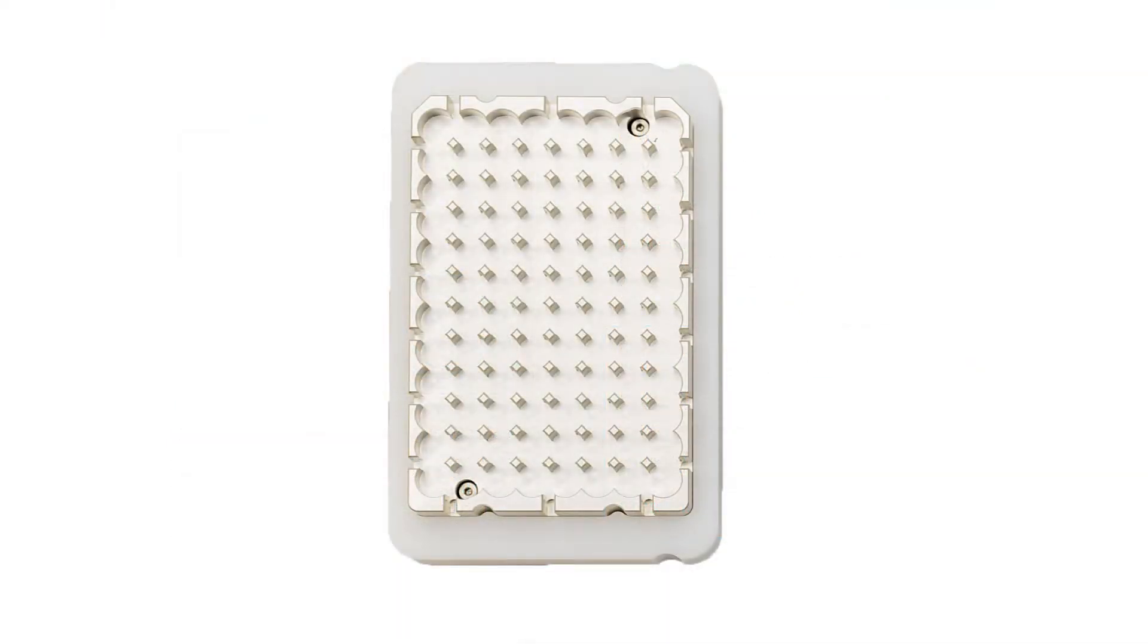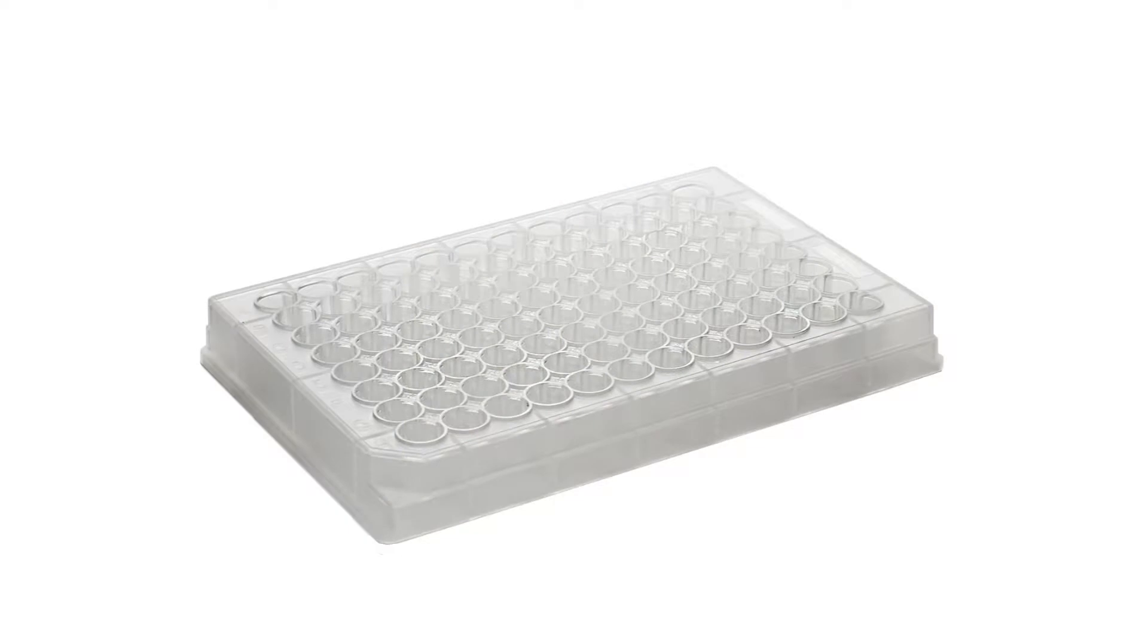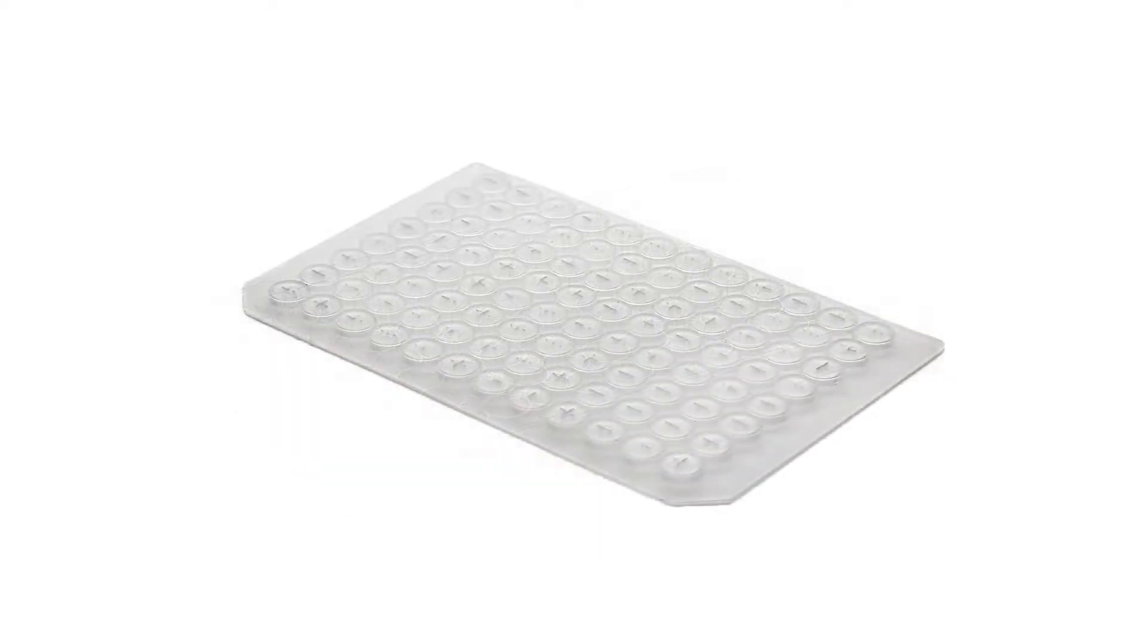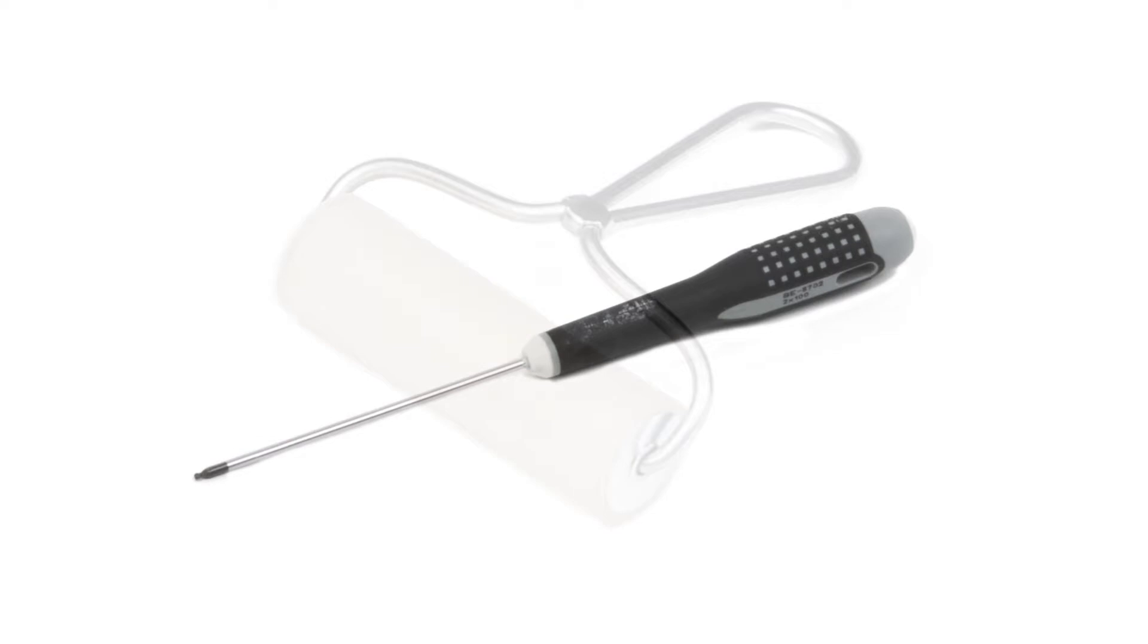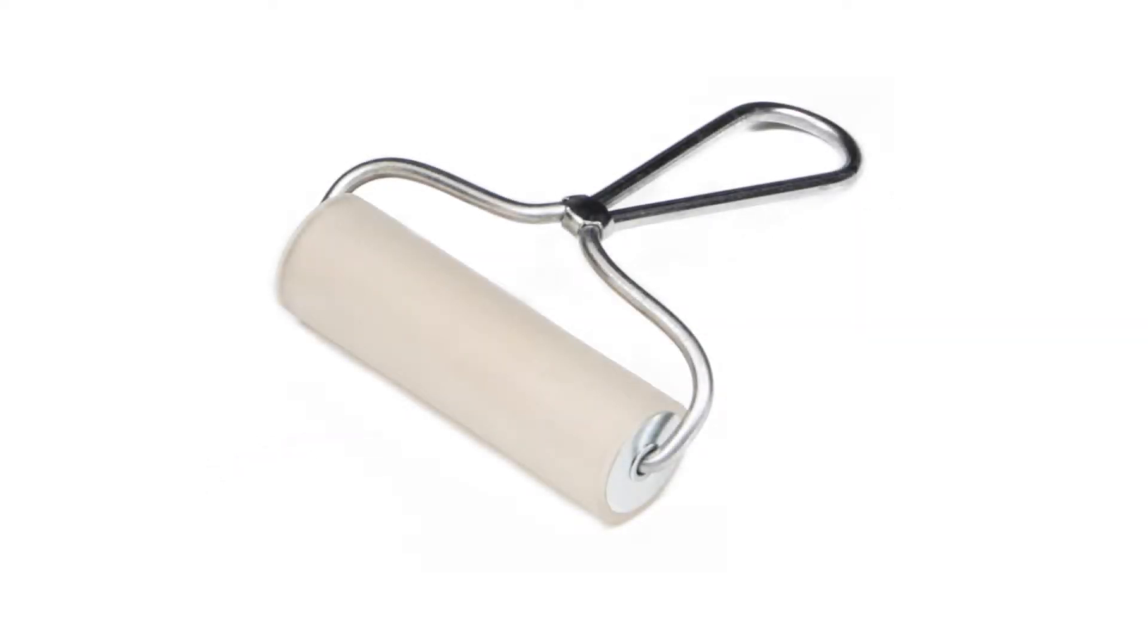A 96 Well Plate Adapter. One pack of 96 Well Low Volume Microplates. One pack of cap mats. One 2mm Allen Wrench. One plate roller for creating an airtight seal between the well plate and the cap mat.